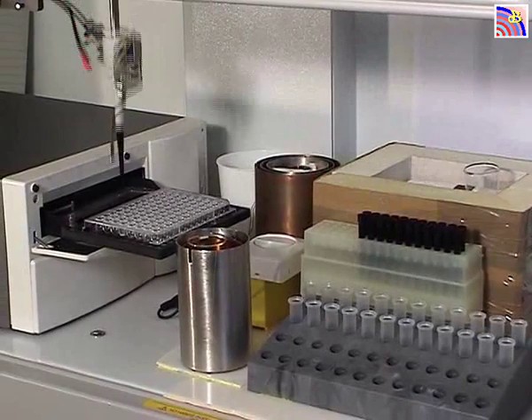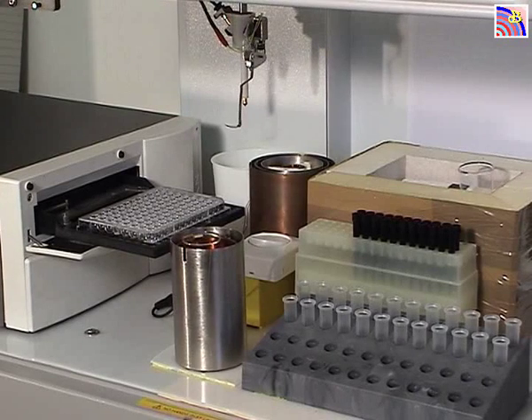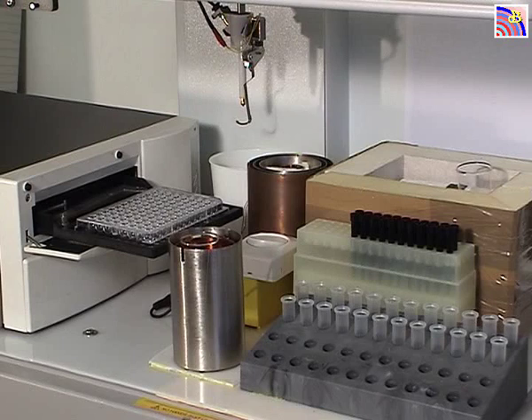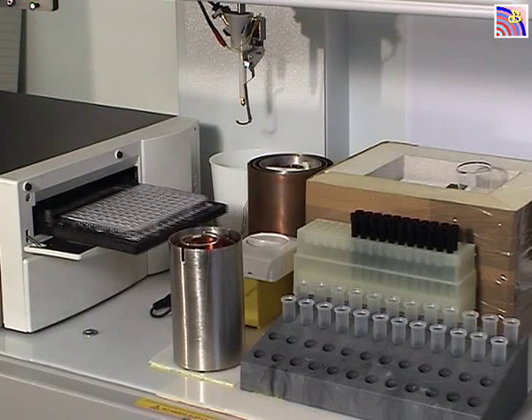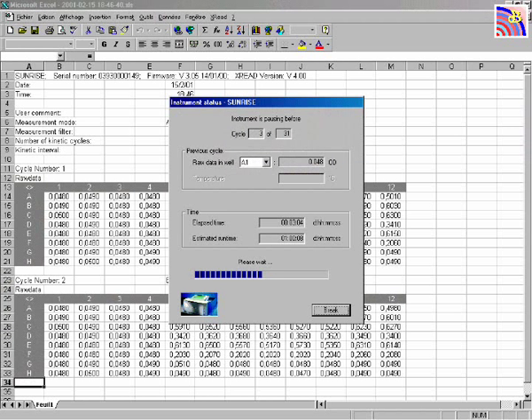Okay, now the eight wells have been filled up with the mixture of water and plasma. The plate is going inside of the machine and it will be measured every two minutes for one hour.